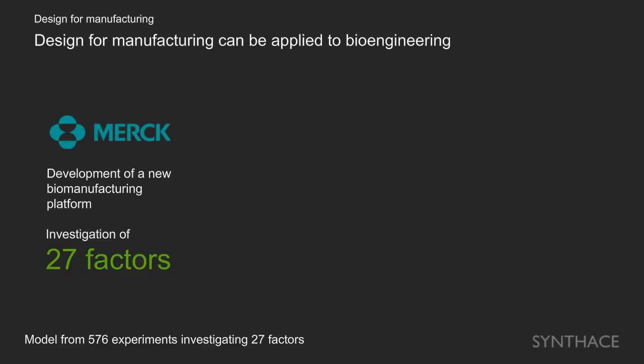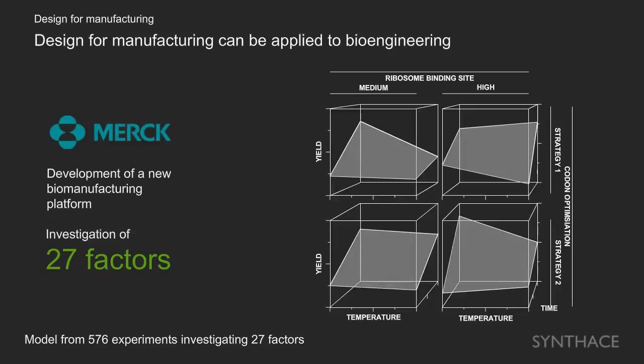And in the course of 10 weeks of laboratory time, we were able to unpick a 4-factor interaction between genetics and environment that was driving a 10-fold yield improvement in that production process. Now, because we're building models, however, we also had an unfair advantage. In a traditional process, you would have been making many variants, genetically speaking, and screening for hits, which means you would have gone with this colony right here.